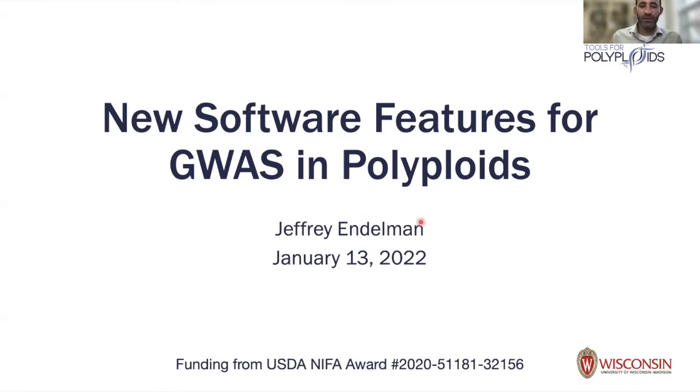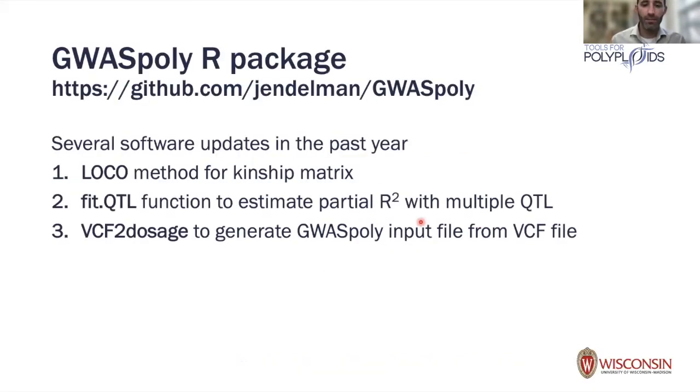Thank you for the opportunity to tell you about some improvements to software for GWAS in polyploids. We're going to start off by talking about the GWASpoly software, which I presented on more broadly at our workshop last year. So I hope if you're new to it, you've had a chance to at least look at that video, because I'm not going back to basics here. And it's available on GitHub from this link.